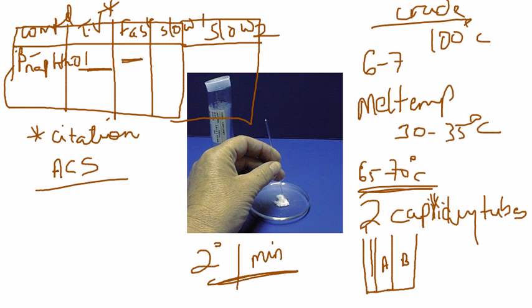So it has to be very, very slow. And as you go, usually on the blue melt temps ballpark, you should not go past like 3. Somewhere around 2 to 3 would usually give you that. But depending on the kind of melt temp you have, you will be able to make your call depending on your sample.